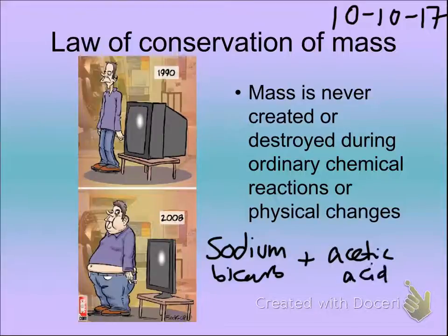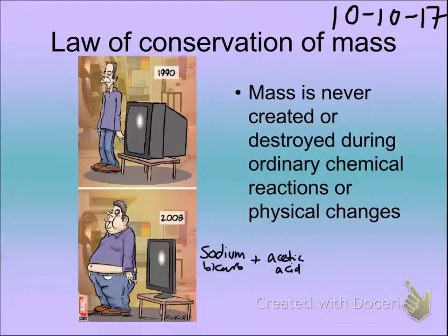We're not going to do formulas or anything on this, but this reaction, and by the way, this is a solid, this is a liquid. What does the reaction produce? You may not know the chemicals it produces, but what's the state of matter of at least one of the products? Oh, it's a gas, yeah. So what we produce is actually sodium acetate, and we get a little bit of water as a byproduct, and we get a whole bunch of carbon dioxide.